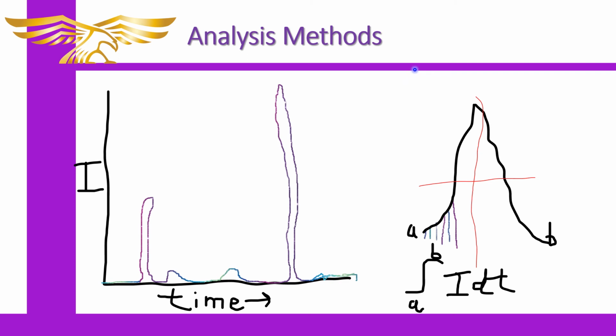But the best way really is to integrate it, and to go from the point where the curve begins and the point where it ends, and integrate it with respect to the distance on the bottom, which would be in time in this case. And so it would simply be this sort of linear relationship here, where you're just getting all these rectangles under here. That would be for that triangular looking kind of curve. Again, it's not a perfect system when you do it that way, and that's why the newer computer models are more efficient.